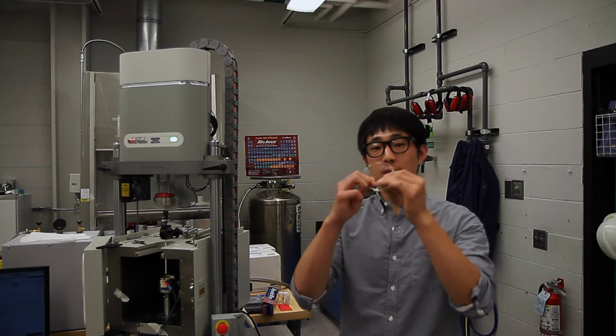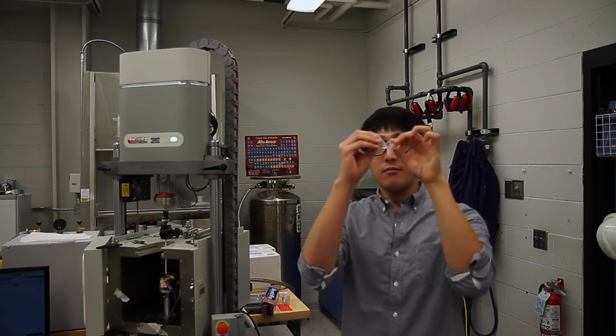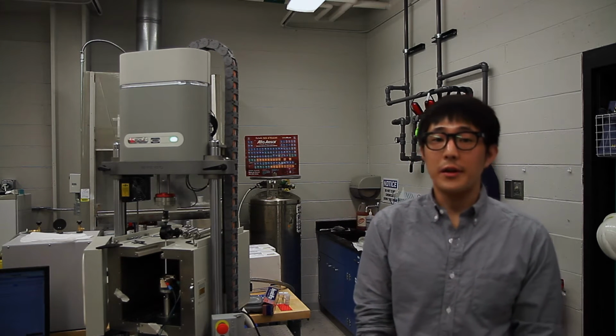The shape memory polymer appears to be glassy, in other words, stiff like a plastic, below the glass transition temperature. On the other hand, it is rubbery above the glass transition temperature. The temperature was measured to be approximately 60 degrees Celsius for our samples. Nevertheless, the temperature does vary according to fabrication processes.